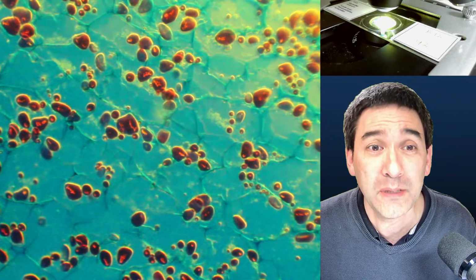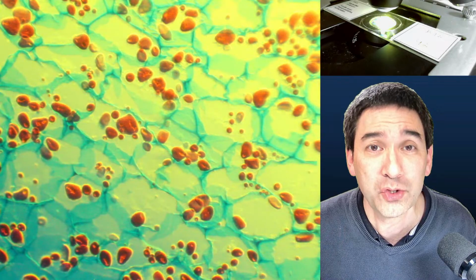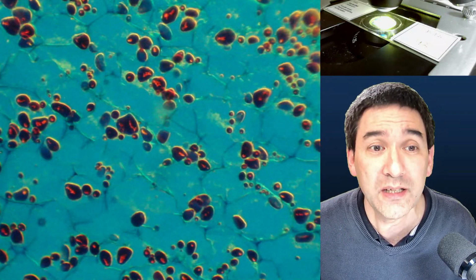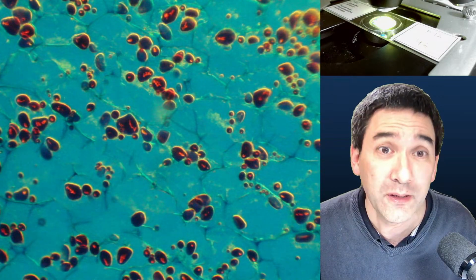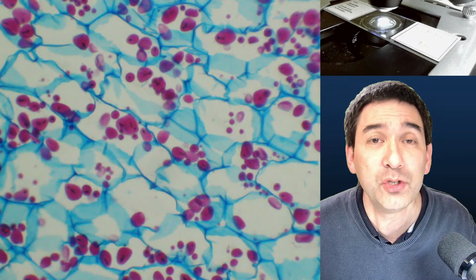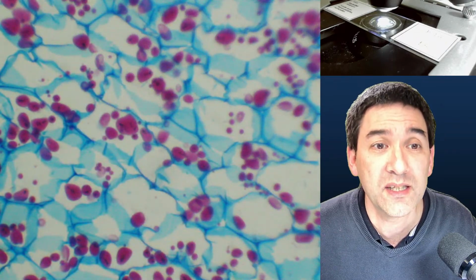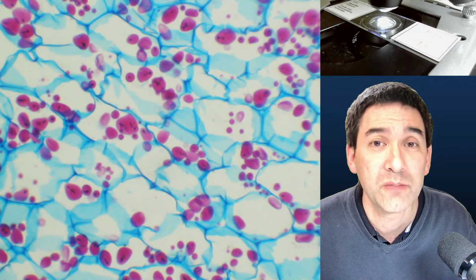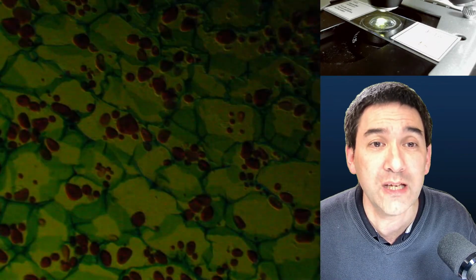And if I basically swing the filter holder in and out a little bit, look, I'm able to change the appearance quite a bit. And if you want to see how this looks in regular bright field, then it will look like this. I have to turn down the brightness. That's basically the regular bright field image, a stained specimen of potato starch grains. So you can see that, just by adding a color filter, you're able to change the appearance quite a bit.